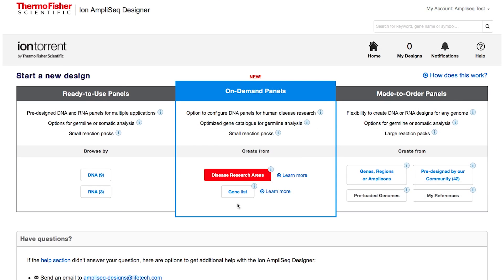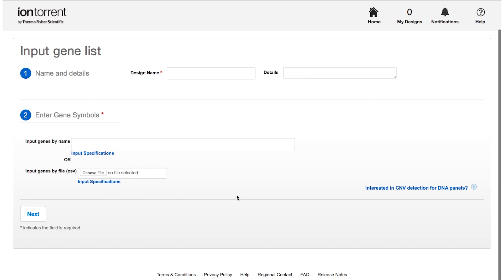Should you need to configure your own panel while taking advantage of pre-tested and small reaction sized panels, you can now also create an on-demand panel by uploading your own gene list, which can be automatically matched with our growing catalog of genes associated with germline disorders.